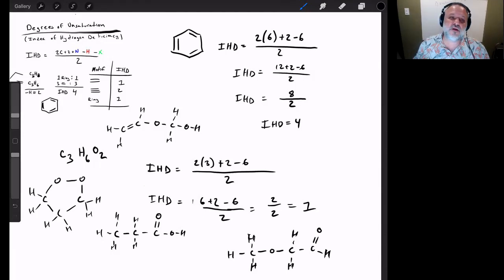Okay, so let's move on from this because we're going to use the IHD. Remember, what I'm trying to do is ultimately help you figure out how to do some of this NMR, IR business, especially for this particular course. This video would be appropriate for the first semester Orgo Lab, where I'm at. The second semester Organic Chemistry 2 lecture, we would assume that you know this, but I'm going to post it in there anyway so that you can have this as review. So let's take a look at how we would do that, and let's start off with IR.